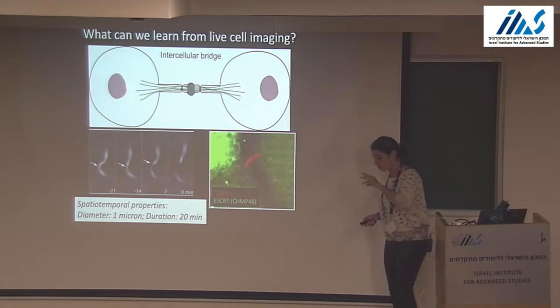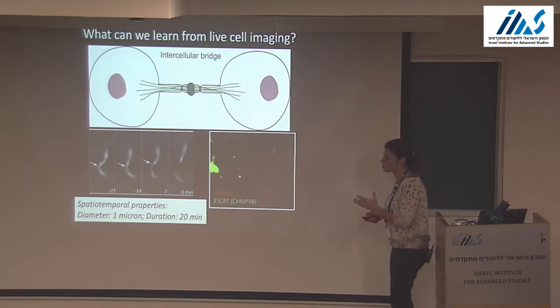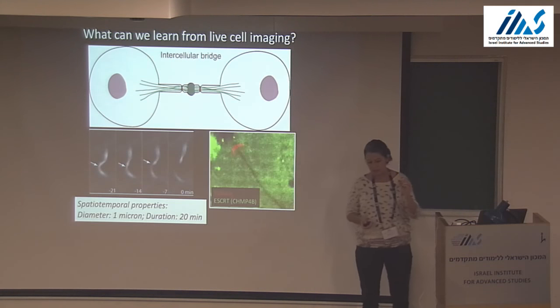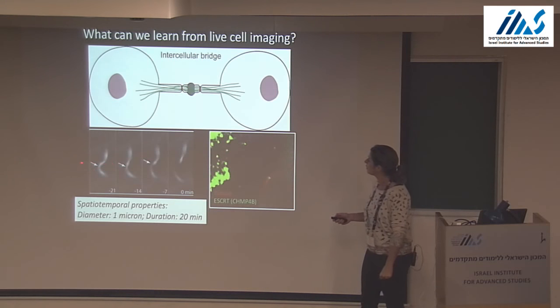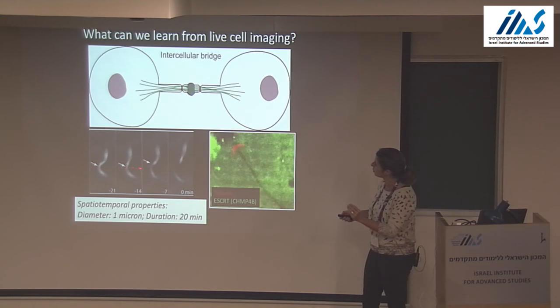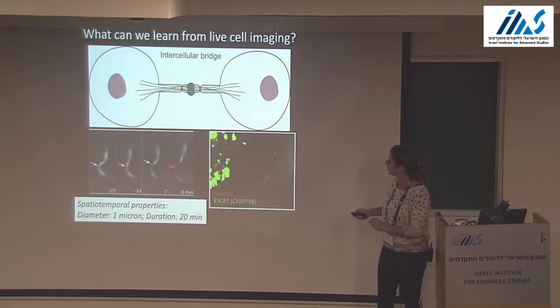So just to show you, this is a slide still from my postdoc work. What we did initially was just to characterize that in a very high spatiotemporal resolution. We wanted to see how the process really looks. The first thing that we saw is that this is kind of a 20-minute event. These are the microtubules. You can see gradual constriction of the microtubule until you end with this fission event.